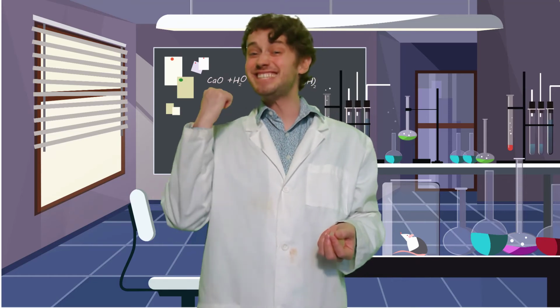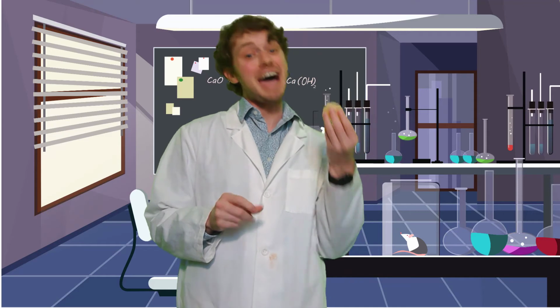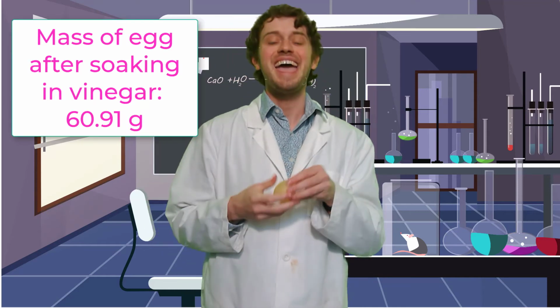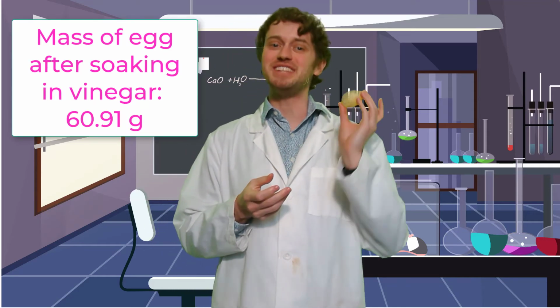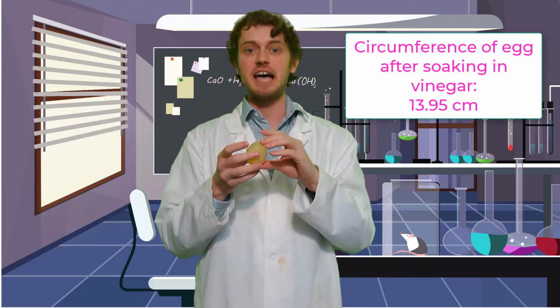It's time to take the egg out of our cup and take some measurements. All right, so you saw the egg in the cup. I have since taken it out. I gave it a little wash. I have found the mass, and I have found the circumference of this egg. And so before I do the next part of this lab, I wanted to show it to you, right? So I'm going to come to you, and here it is, right?